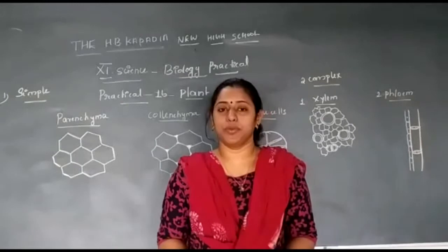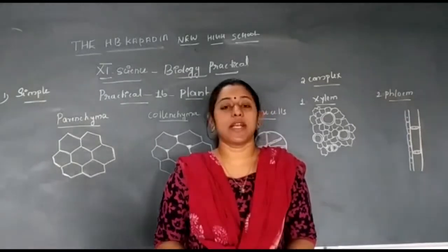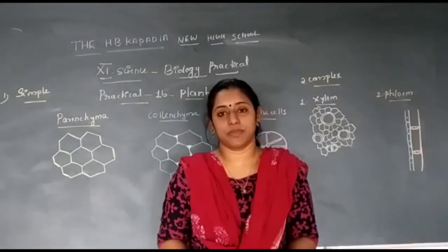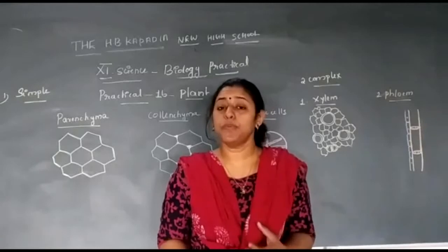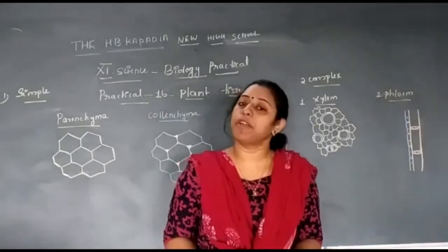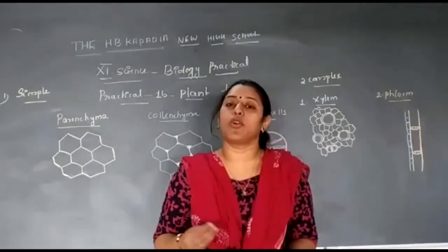Today we are going to do another 11th standard biology practical, that is the types of plant tissue. So you know what is tissue? Tissues are groups of similar cells having the same structure and performing a common function.